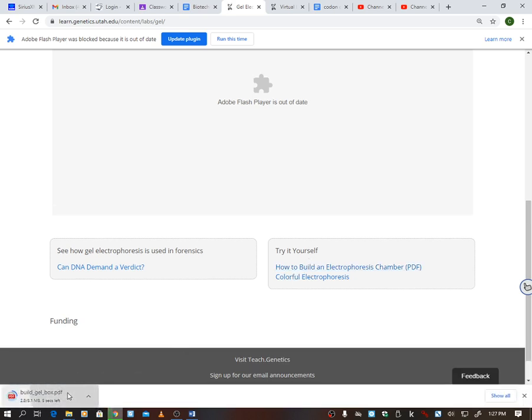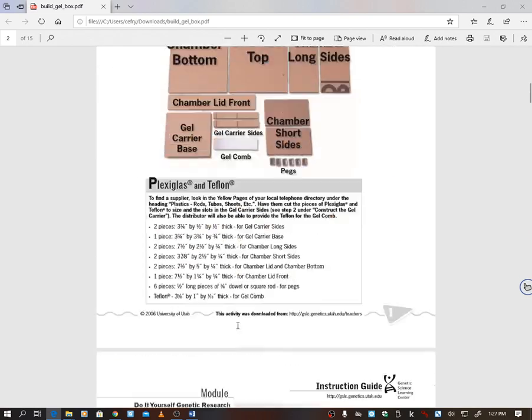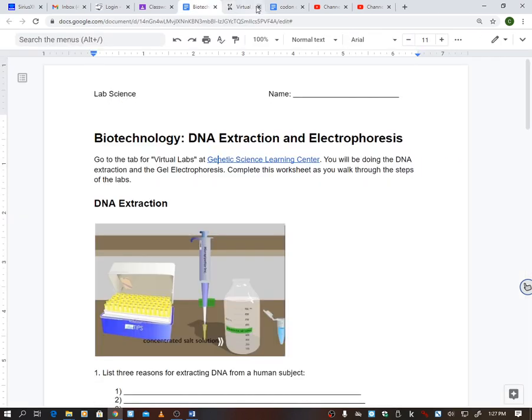Alright guys, well I'm going to have them at least walk through the first one. So this may only take the one day. I had planned on 2 days just in case to do both. But this may just take us the one day, and we'll just walk through the extracting DNA. I really hate that because it was really nice to be able to see how this works since we don't have the machinery to do it.